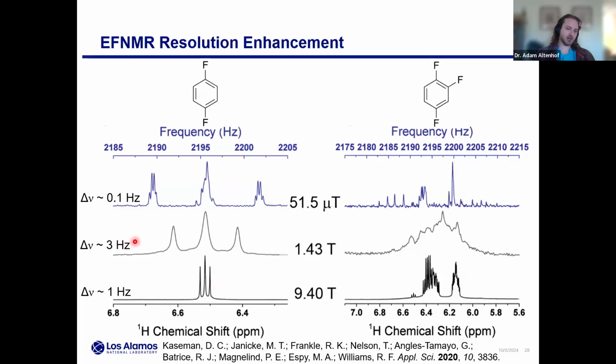If you go down to benchtop, the line width starts to take a pretty big hit. This is a pretty inconvenient field regime for resolution. And then ultimately at Earth's field, we have something like that triplet structure, but really strong coupling is active here. That means we have the full interaction Hamiltonian, and that just means we're going to see many more peaks. So what is nice about this, if you can fit your J couplings, you're ultimately going to get a much higher precision determination of those J couplings, but now also access to the sign of the J coupling in just this 1D spectrum.